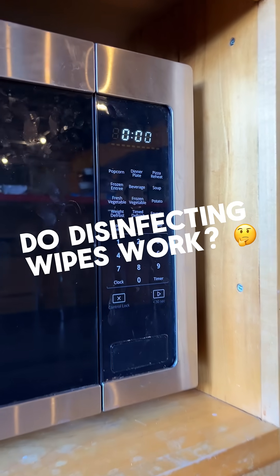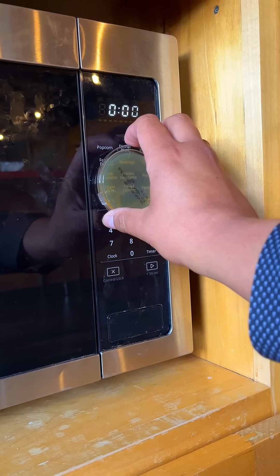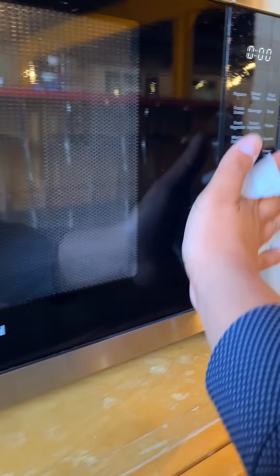Will everyday disinfecting wipes pass the germ blast test? Step one: we're using a contact plate to sample the microwave. This will capture any bacteria hanging out on the surface. Next, we grab a disinfecting wipe and, like most of us, we wipe it down and call it good.